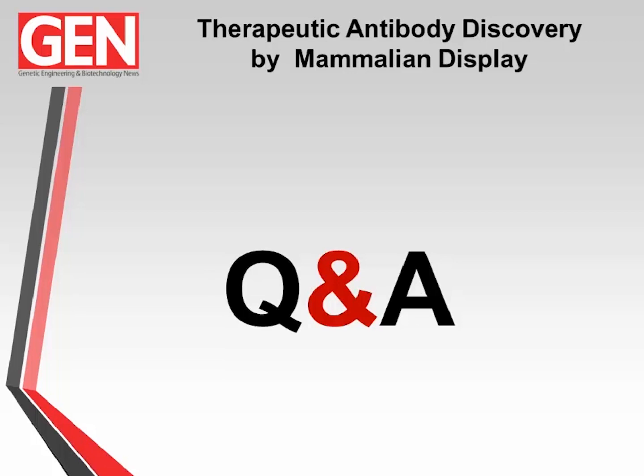In fact, our experience of making mouse antibodies by going to patents and recovering antibody sequences is that most of the time they express less well than we're used to seeing with the human antibodies from the phage system. So yes, in short, antibodies can come from any source.